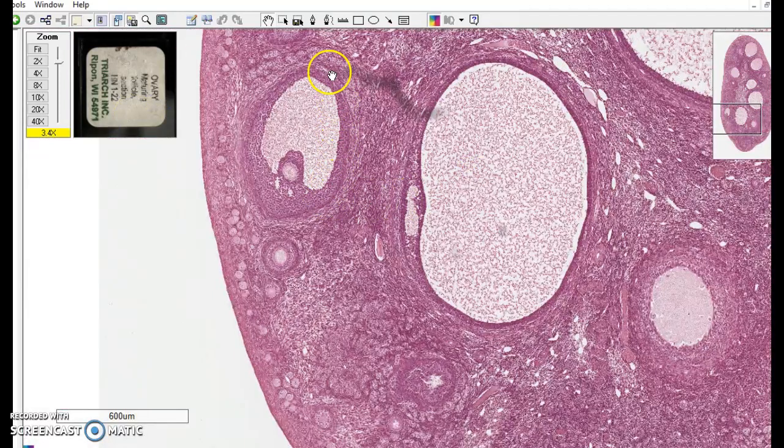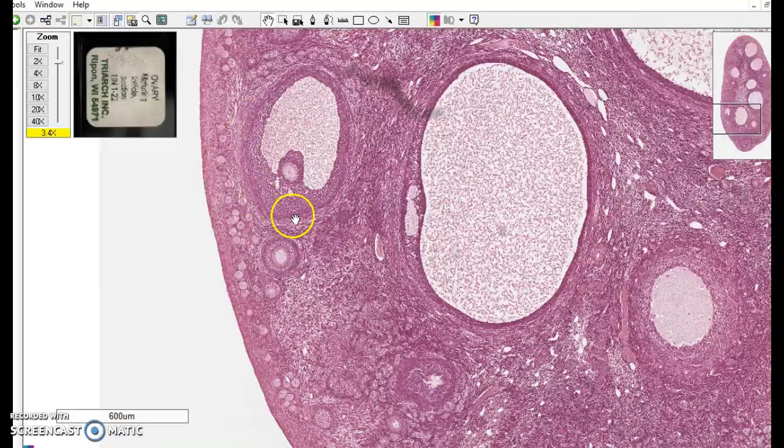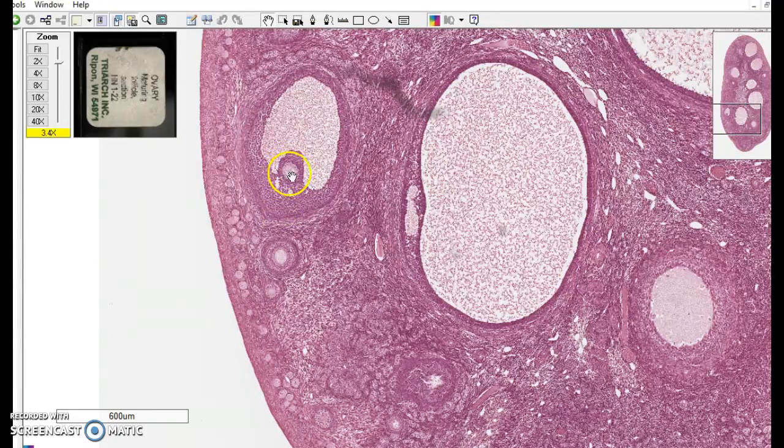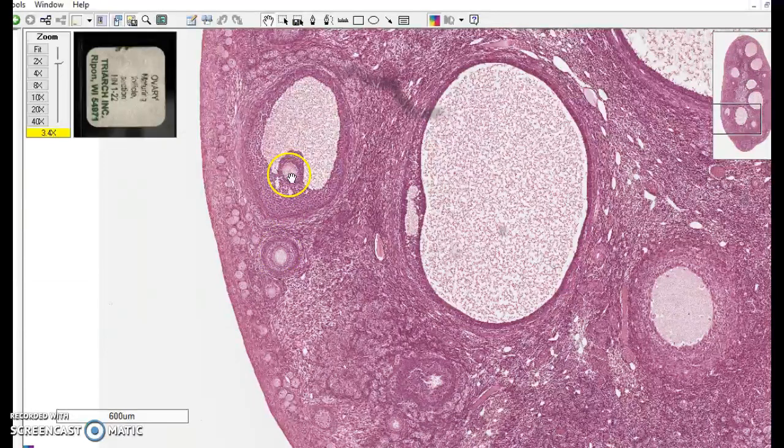Here is a basement membrane. This structure is called a follicle. This large cell in the center of that, you see another one down here in a less mature follicle, is an egg. That's the human egg.